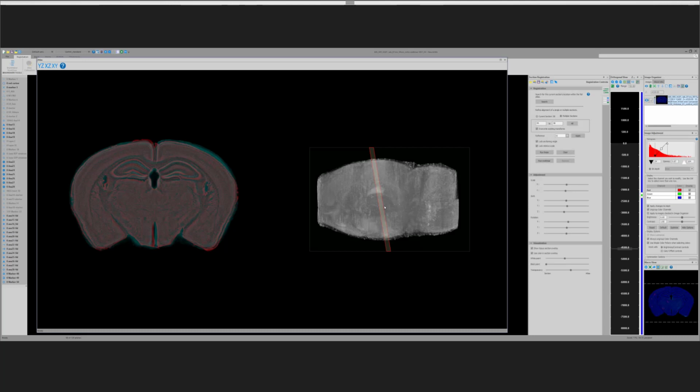So it's gone through now and applied the linear transforms, in this case just to the 3 sections. After it does those 3 sections, I would now run the nonlinear part. It does the same thing, and what we showed before for the individual section, it's going to apply the nonlinear transform section by section all the way through.